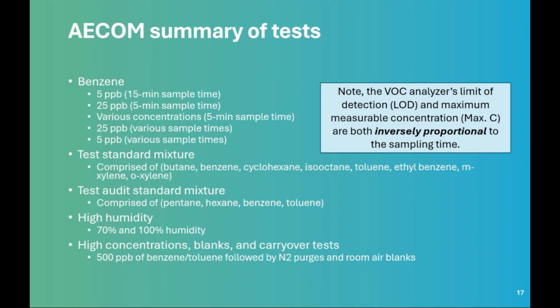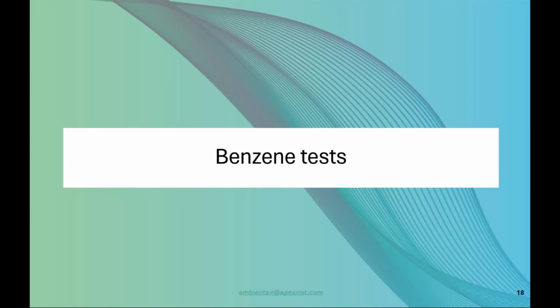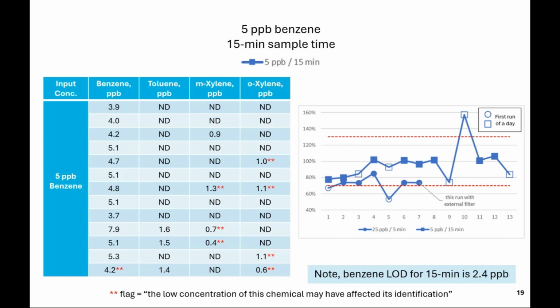The next set of tests will look at test standard mixtures, so custom mixtures of different VOCs. Some of those mixtures were also measured in the presence of higher humidity, both at 70 and 100% humidity. And then the last set of tests I'll share relate to higher concentration sample and following blank and carryover test results. So first, looking at those benzene tests.